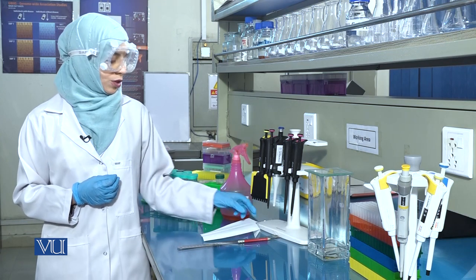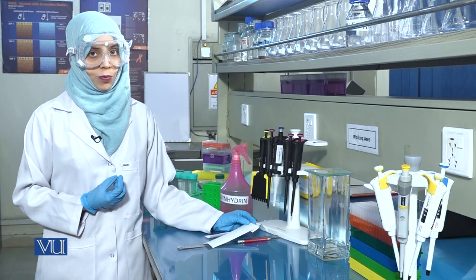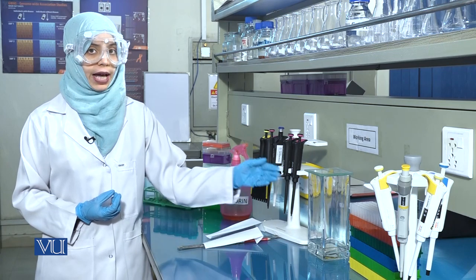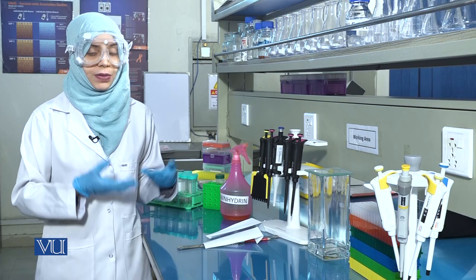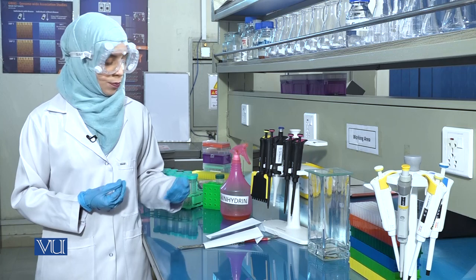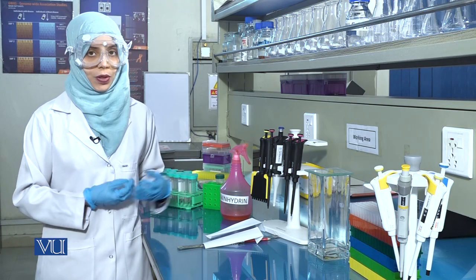In paper chromatography, the biomolecule or a solution of biomolecules is spotted on a piece of filter paper, which is then placed in an organic solvent. The organic solvent rises up the filter paper by means of capillary action. As it moves along the filter paper, it takes the biomolecule along with it.